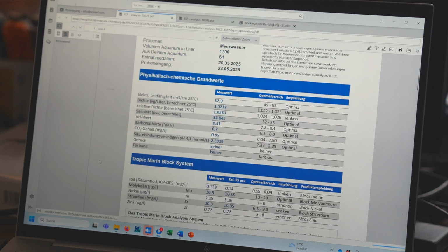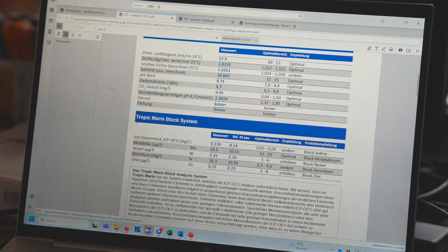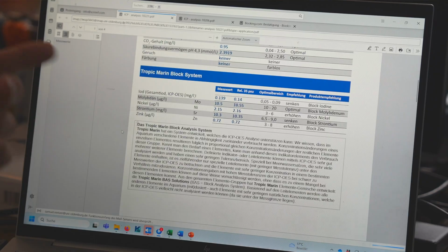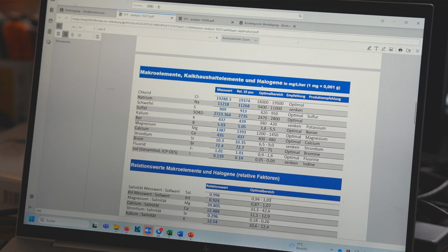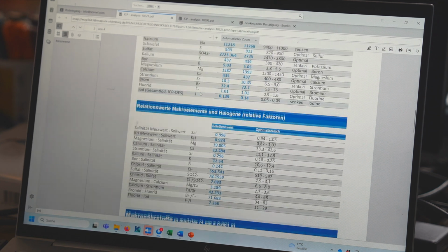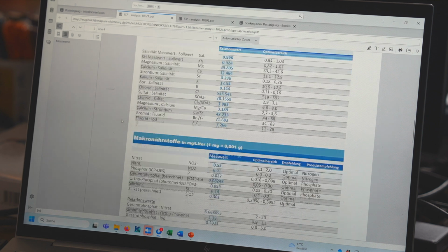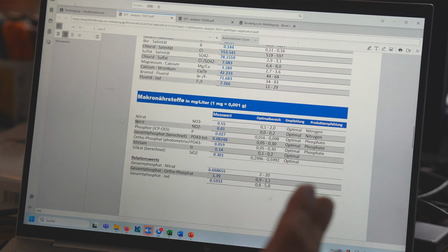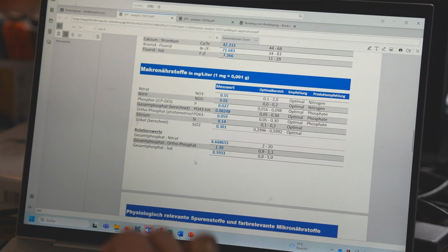Basically here, the first category, you get values for everything because it's all measured at different devices, so it's more effort to do it. The block system indicator elements and the macros. So now here chlorine is also measured, and also really important, the fluorine. Get all the relations. And with a plus, you also get the nutrient concentration. So they measure nitrate, nitrite, phosphorus, and the phosphorus is then split into orthophosphate and the total phosphate, like different configurations. You get the relations of the nutrients.